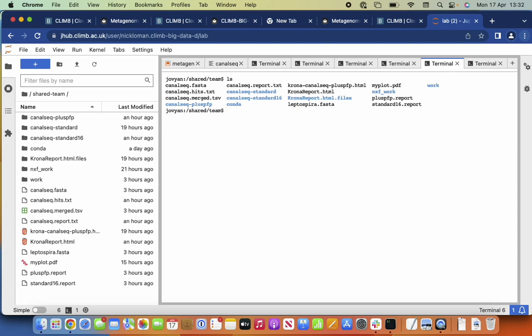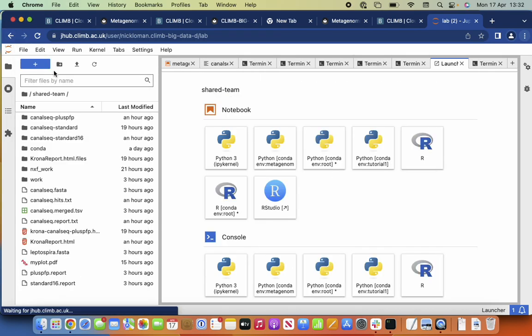That's great for training and things like that, because we don't need to worry about how to get people onto the system, setting up SSH keys. It will go through firewalls more easily, so people can get to this that maybe wouldn't be able to do an SSH session, perhaps if they're in particular corporate or government environments, let's say. So you can go in and do stuff from the terminal. But you can also use the system in many other ways.